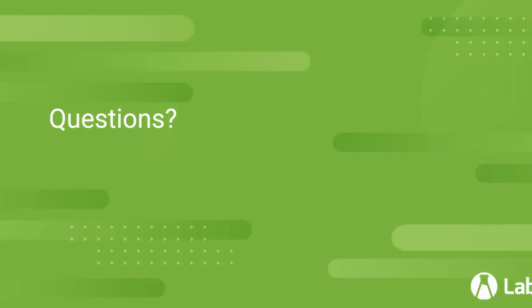Okay. Yeah, we are working on our first iteration of supporting Jupyter. Just to tamp down expectations, we are not hosting yet. Maybe in the future if there's demand. We're not hosting the Jupyter interactive editor, but we are implementing the ability to take a Jupyter notebook and run it as a report, very much like you would run a knitr report, using the R reporting engine. I don't know if we'll call it final or experimental in 22.7, but it is coming out very shortly, in a way that you should be able to experiment with.